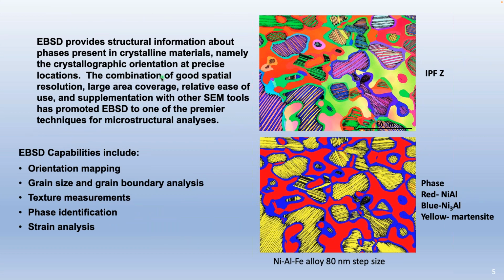So EBSD is a great technique. We're probably all very familiar with it. I just put this slide in so we could reiterate what it's good for. It has this great combination of being able to form images. It has good spatial resolution. We can now cover large areas. It's relatively easy to use nowadays. It's not as fiddly as it used to be.